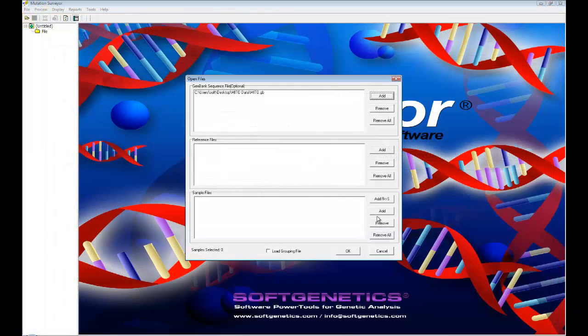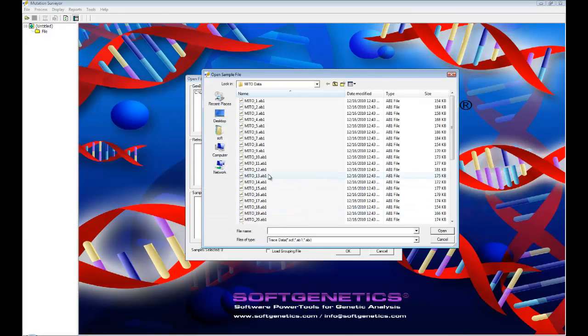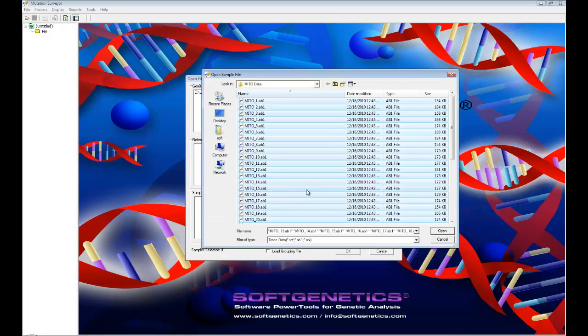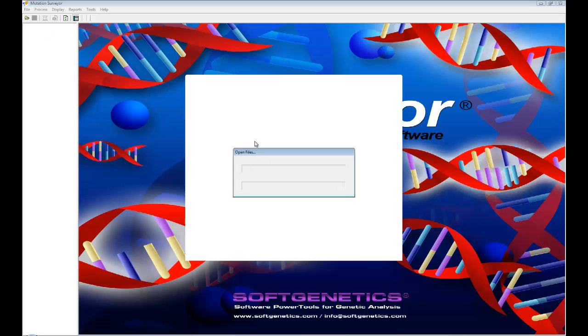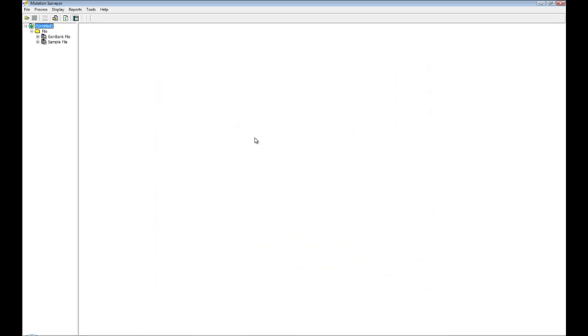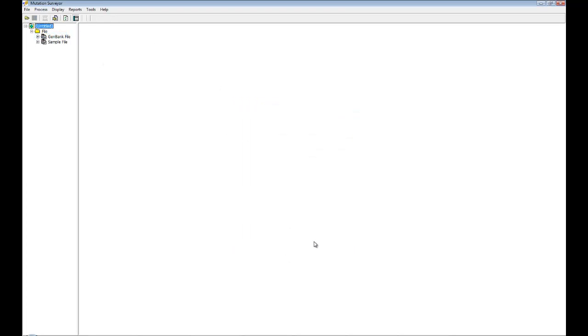We can now load the mitochondrial sequence files and adjust the mutation project settings. When your files have been loaded, you can adjust the mutation project settings to default parameters as these will work well for mitochondrial sequence data. After determining the settings, click on the Run button to analyze the data.